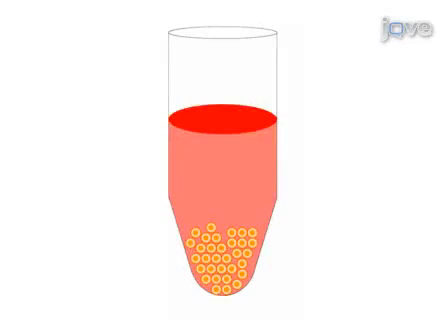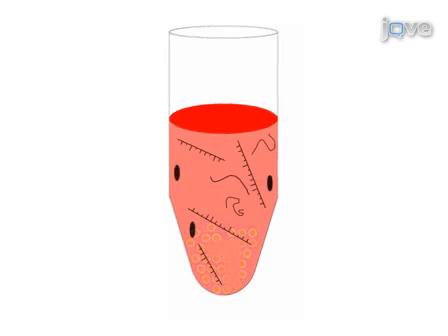To start the RNA isolation and to attain sufficient yields, 50 zebrafish embryos are pooled into a mortar microfuge tube. The RNA is first extracted using trizol reagent and chloroform after being homogenized thoroughly.